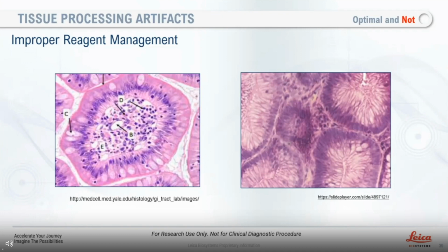Okay. Thank you. You bet. Next question. What's the best fixative for breast tissue?